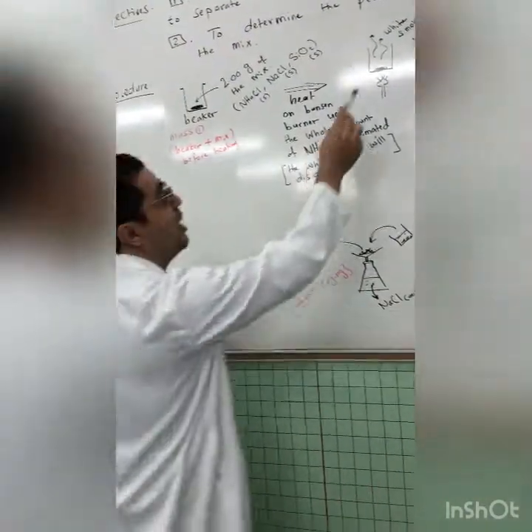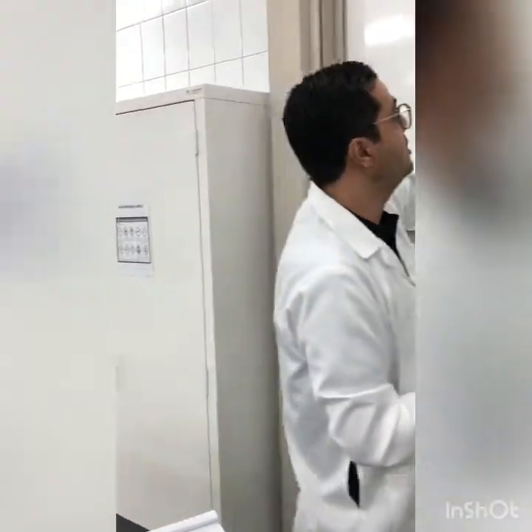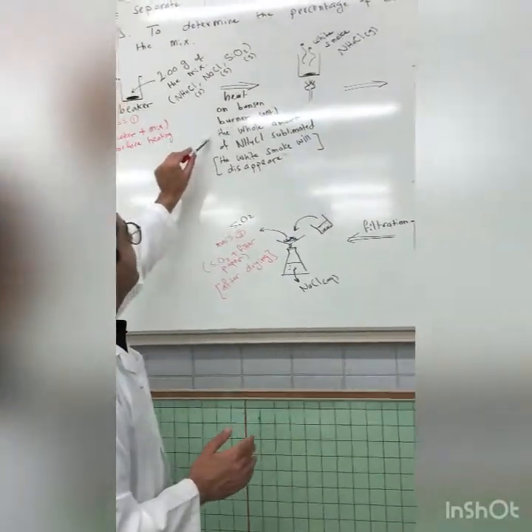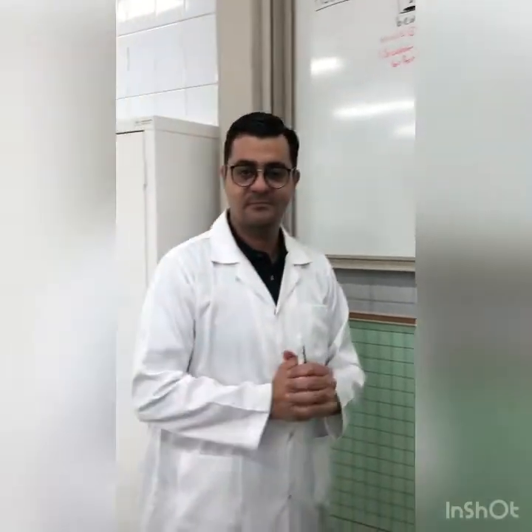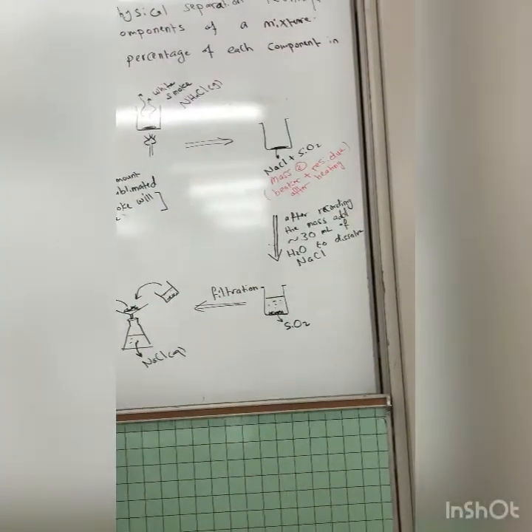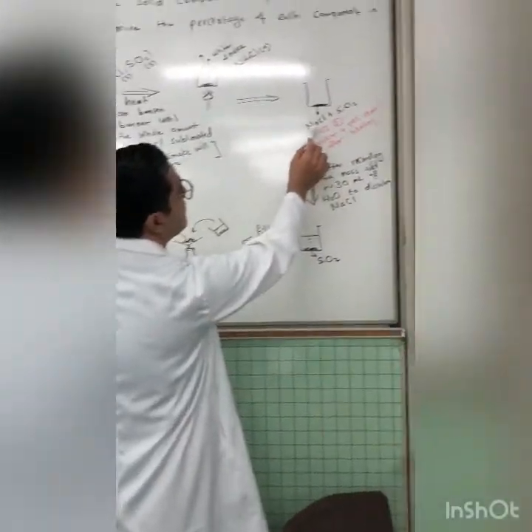After heating, ammonium chloride will sublime and appear as white smoke. You will observe the appearance of white smoke, which represents the gaseous ammonium chloride. We should stop the heating process when the white smoke disappears, which means the entire amount of ammonium chloride has sublimated. After this step, we will end up with a beaker containing the remaining residue — sodium chloride and silicon dioxide.